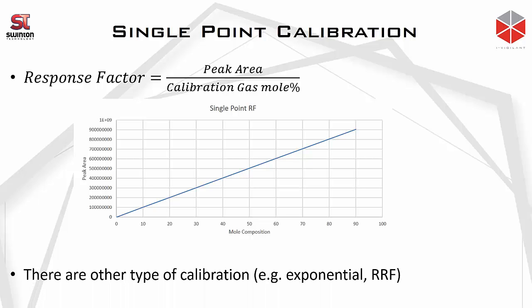There are also other types of calibration, such as the exponential calibration response factor, as well as the relative response factor. But what I'm going to focus on here is a comparison between the single point calibration and the multi-point calibration. The same principle can later be applied to compare the multi-point calibration against other types of calibration in the system.